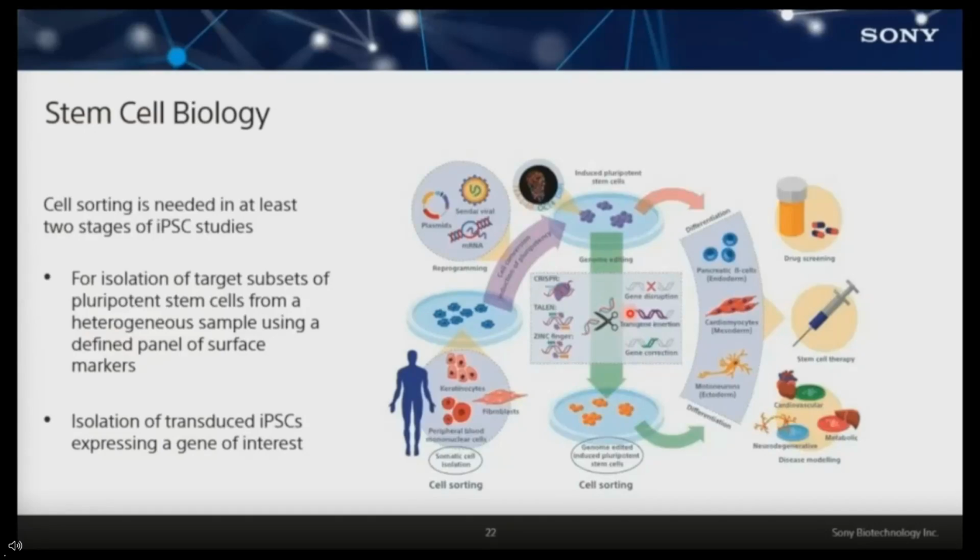They're going to form an organ or they're going to do something downstream, right? So maybe not all of those cells have been successfully engineered. So you go through another sort or selection process to enrich and purify those cells. And then you're ready to take those cells to your downstream application, which might be drug screening. It could be stem cell therapy. Maybe this is in an animal model.